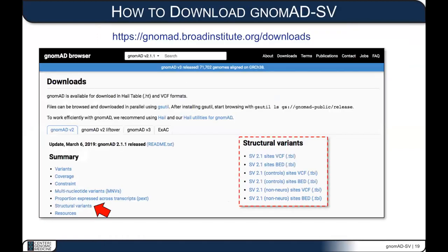If you prefer to work with this dataset from the command line, in R, or as a database for web applications, you can download the data. Go to gnomad.broadinstitute.org/downloads, click on structural variants under the summary section, and you'll find both VCF (variant call format) files and BED files, depending on your preferred format. We also provide these files as downloads for the controls-only subset as well as the non-neuro subset mentioned earlier.